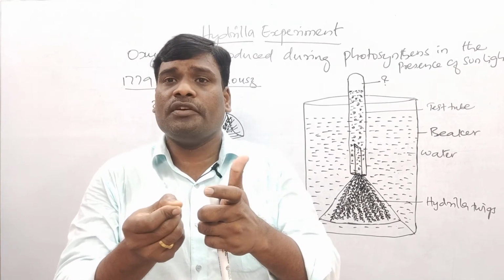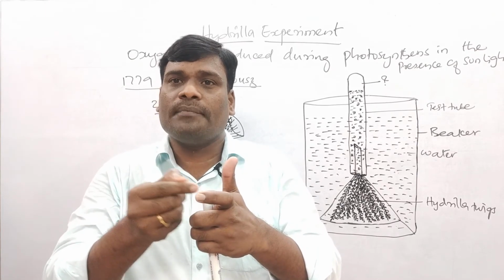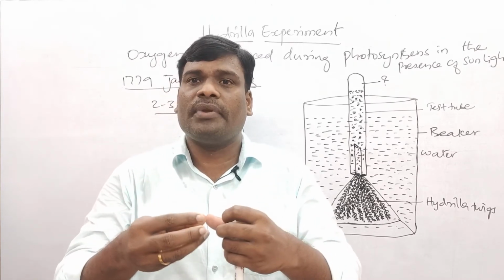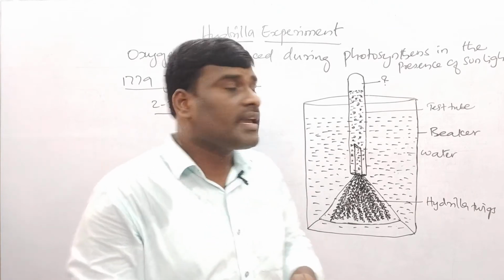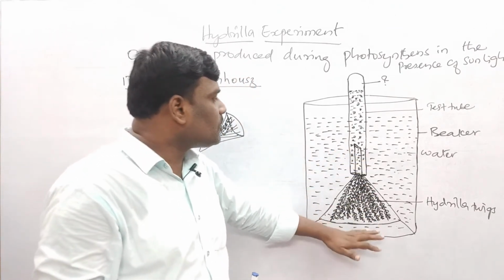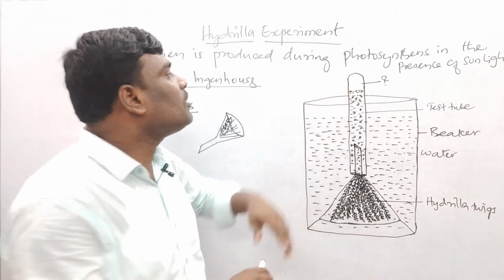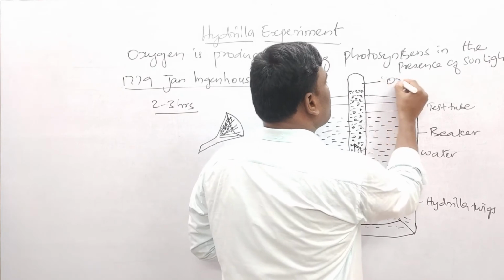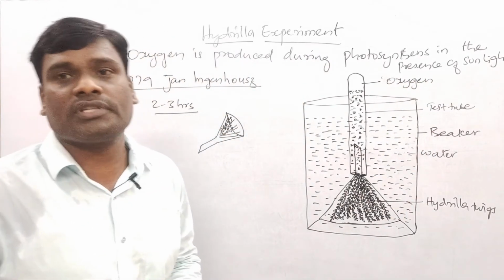So when you open your finger, the gas which is present in the test tube comes outside. As a result, the burning matchstick burns brightly. So this shows that children, the gas which is evolved during this process is what? Oxygen gas. So the gas which is liberated or produced is an what children?